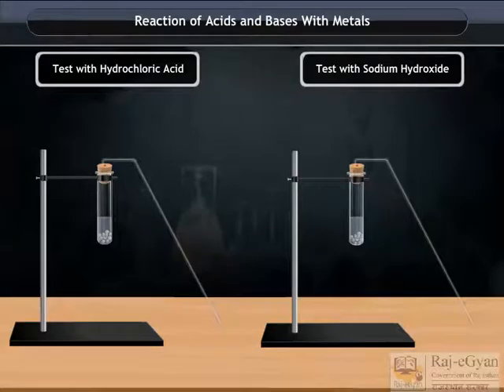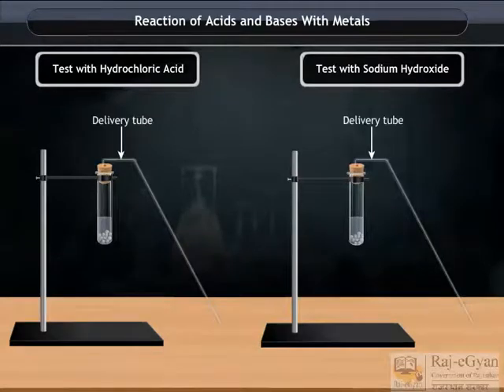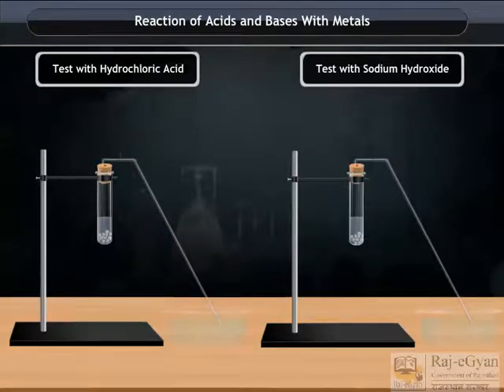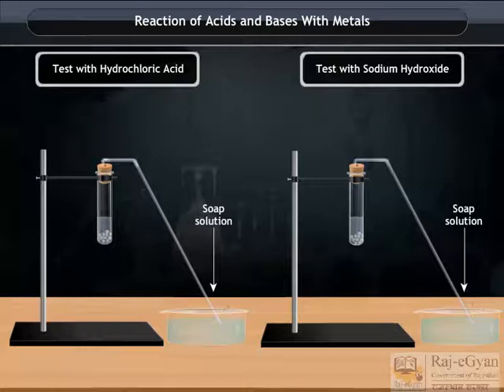Close the mouth of both the test tubes with a delivery tube, and the other end of the delivery tube should dip in the soap solution.